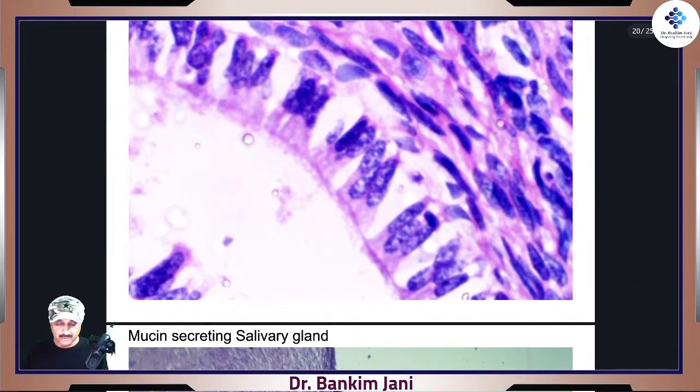But still you can appreciate that those cells are basal: characteristic basal, elongated cells with lots of cytoplasm. Yes, those characteristics are seen in whatever number of cells we watch. Classical, all elongated cells. They are basal, long cells. Okay.